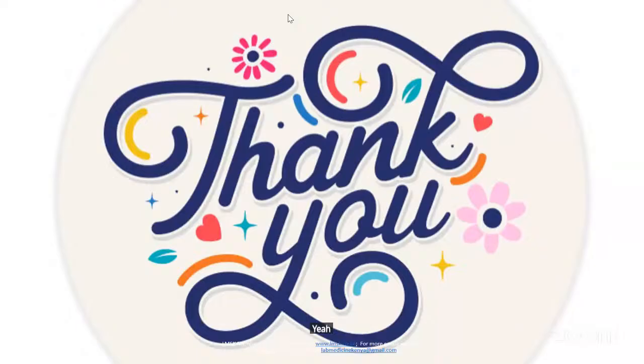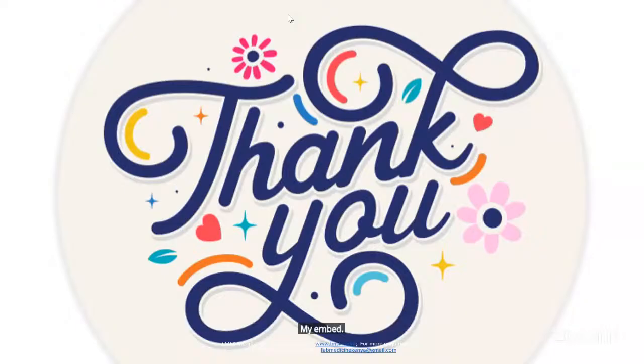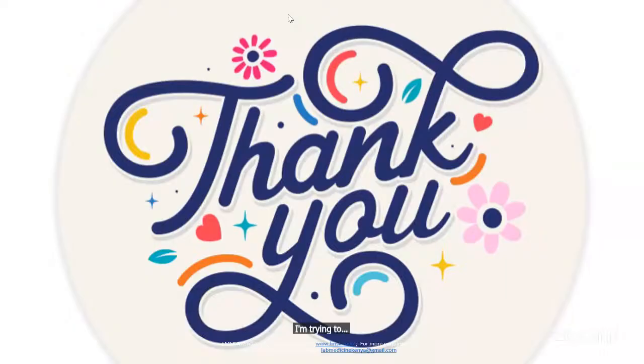If I try to get his question, he's trying to ask if the scientist or the technical team's roles are restricted to mounting, meaning that they can only do the grossing process, embedding, microtomy, and then stain, and then mount, then dispatch the slides for pathological review. I think that's what he meant, if the farthest we can go is mounting.